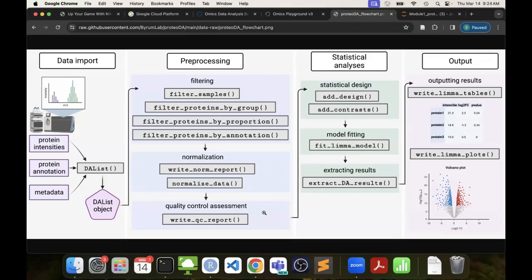The QC report includes your PCA plots, your dendrograms, and extra pieces of information. Once you look at the QC, in that plot you can see, okay, I've got a lot of missing values down here. I might want to do more filtering, or you can start making some other decisions. Pre-processing is probably 80% of a bioinformatics job, just formatting and pre-processing.